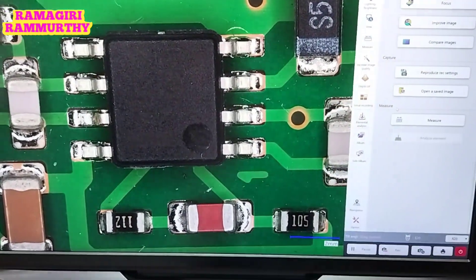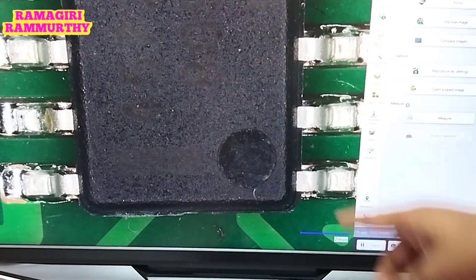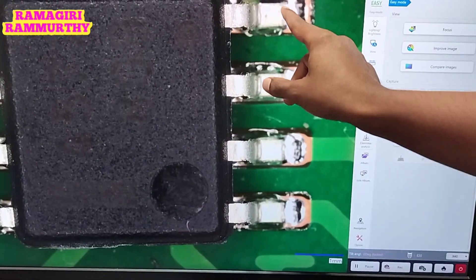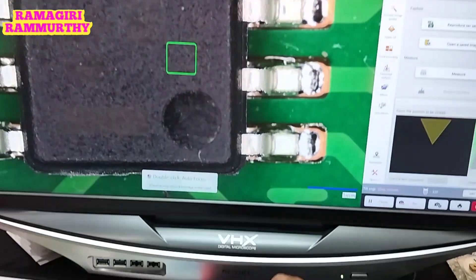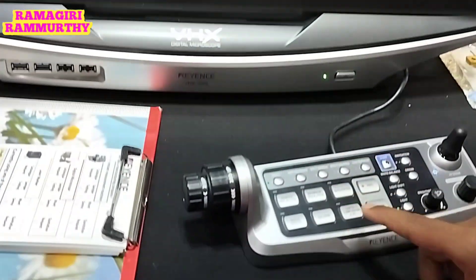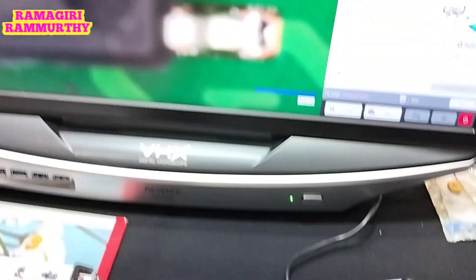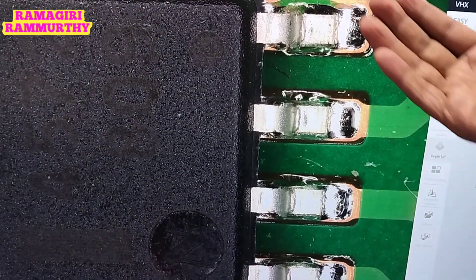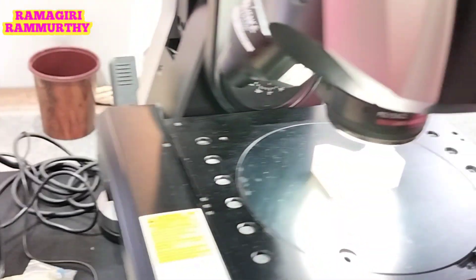Now let's say I want to increase the magnification. I can easily increase it using the same console. Now we are at 40x. You can see there are some things that are blurred out, because the VHX depth composition system is going to take multiple images, and even at higher magnification you are going to get a focused image.